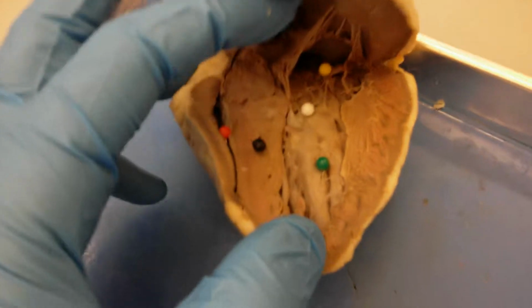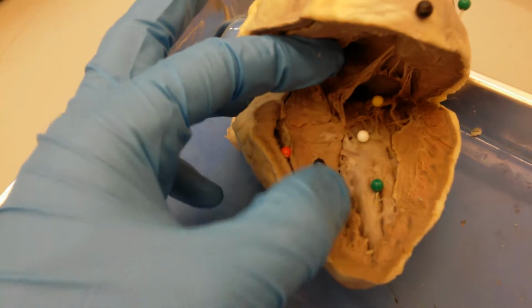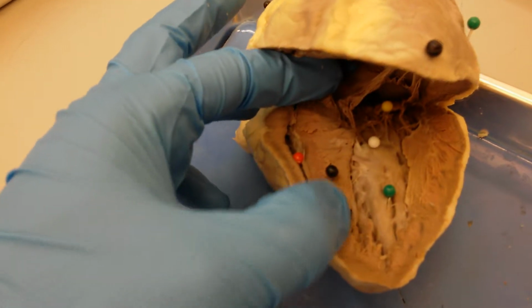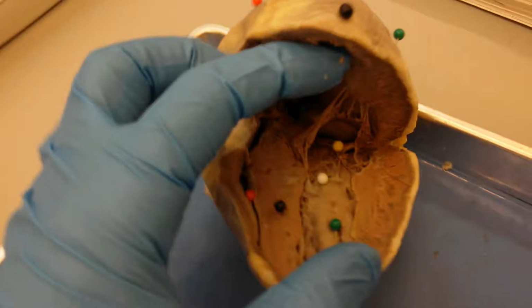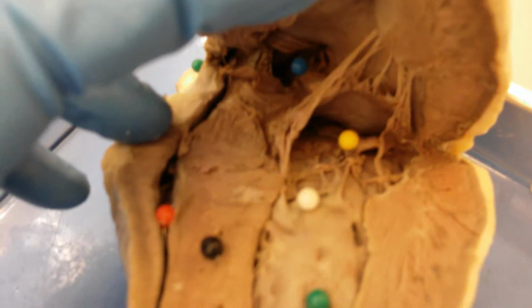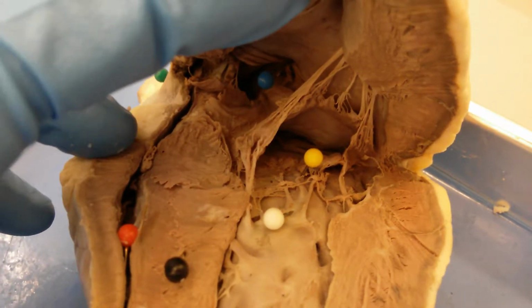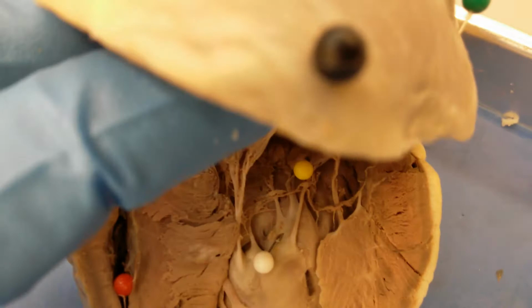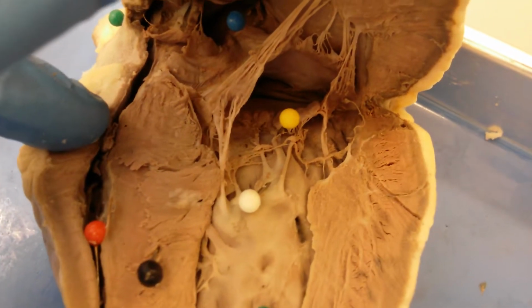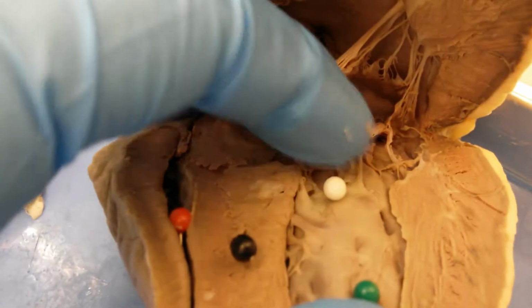You can see here separating the two ventricles is the interventricular septum. This is marked with a black pin right here, okay? And then you can see over here, marked with the white pin, is the papillary muscle, right there, which connects to these cords called the chordae tendineae.